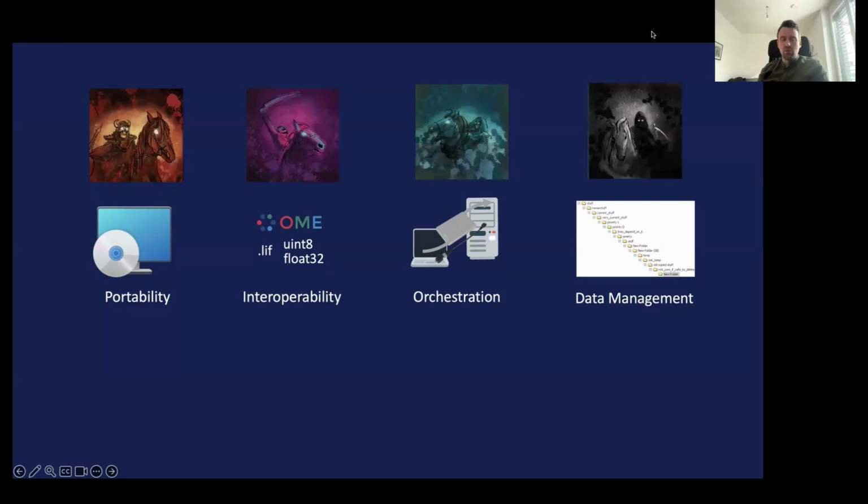This is how it works right now. Right now, Arkitekt is sort of a Docker image. So you need Docker, which is a sort of virtualization engine, to run all of the Arkitekt services and to manage dependencies. That's something I use internally a lot. If you want to install Arkitekt on a server, you need this Docker environment, which is pretty easy to install nowadays. But you definitely need that step on one computer in your team.